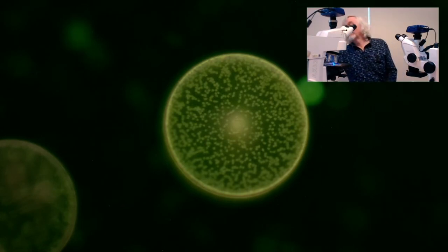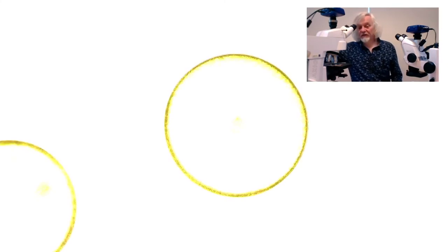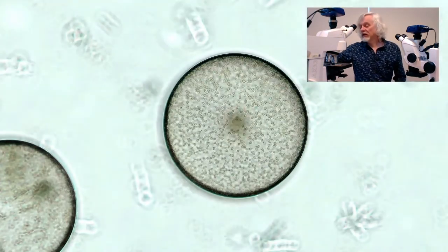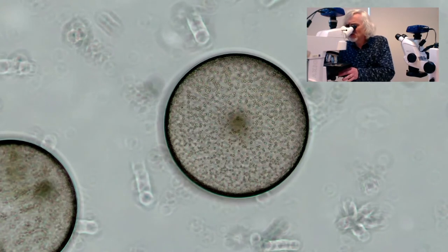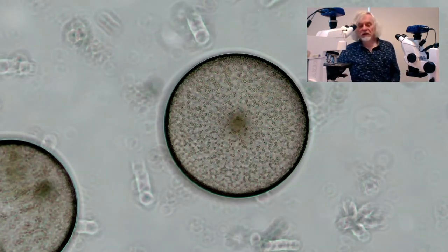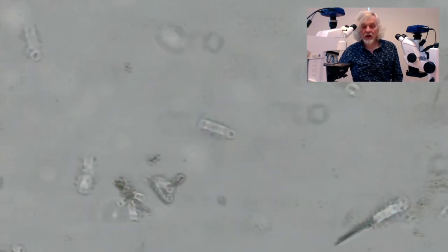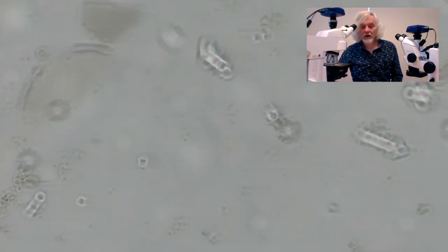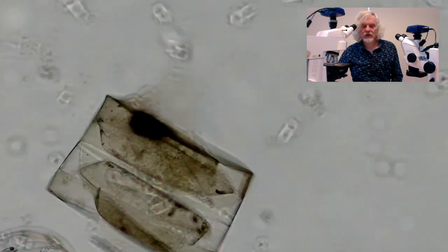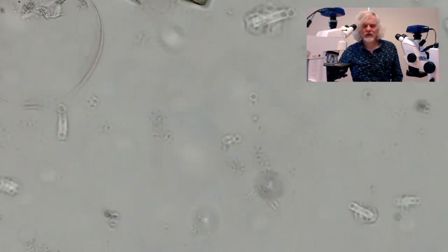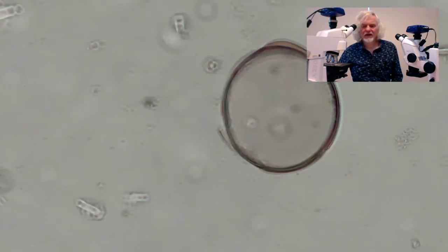But what I really wanted to show you is what the surface of one of these things looks like with the right illumination. I know where it is. I need to go down here a little bit and then across. Oops, no, not that way. The other way. Across... There's one that's on its side and then across a little bit more.